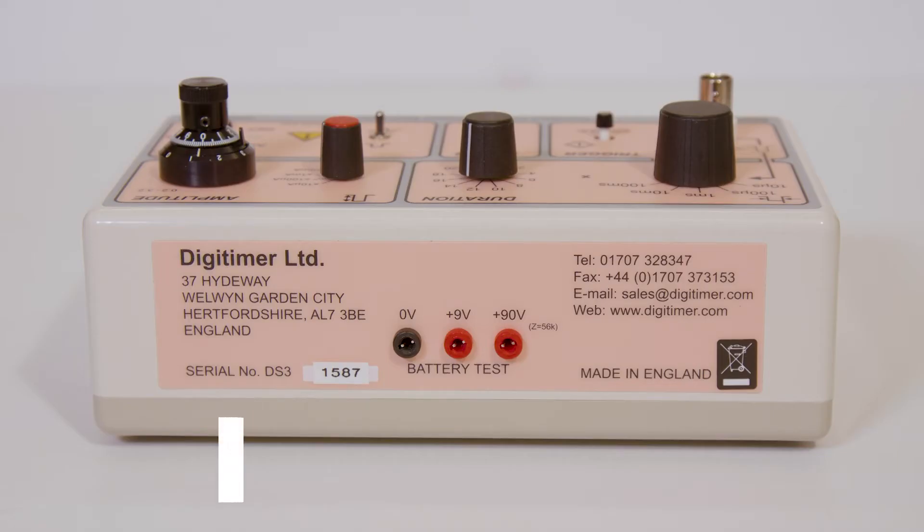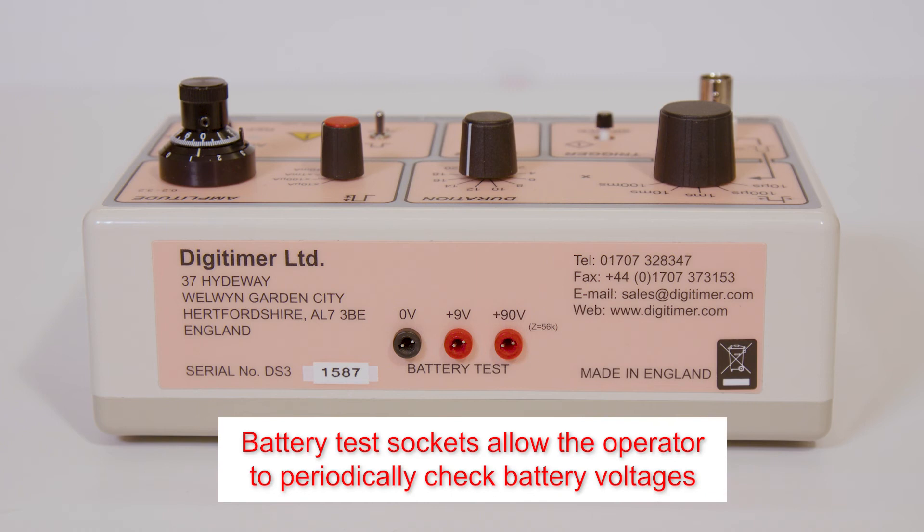Battery test sockets are provided to allow the operator to check the battery voltages. We recommend setting the DS3 to a 2 second long pulse and measuring the voltage while a stimulus is delivered through the usual stimulation electrodes placed in a dish of saline. This stresses the batteries and ensures they do not give falsely high readings.